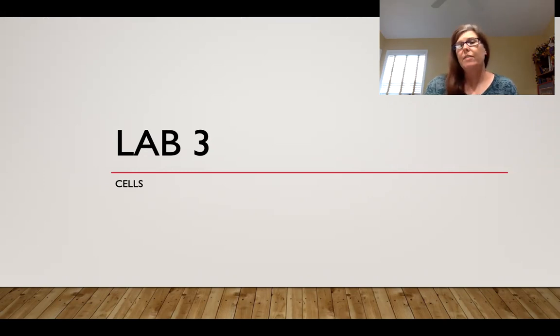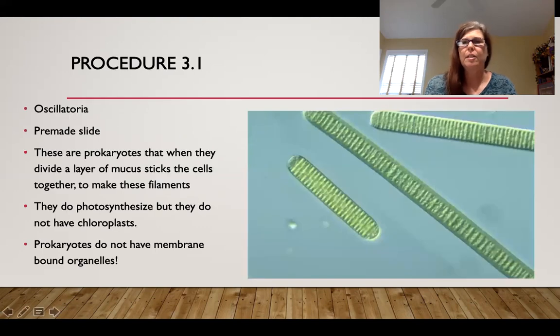So in this lab, we would have taken the skills that we would have learned using the microscope, and we would have then looked at some actual cells. Now remember, we're studying two different types of cells: either prokaryotic or eukaryotic. Pro means before, and karyon means nucleus, so before the nucleus. So this would be our bacterial cells. And then eukaryotic, after the nucleus. So you need to know the difference between prokaryotic and eukaryotic cells. I talk about this in a couple different places throughout this presentation.